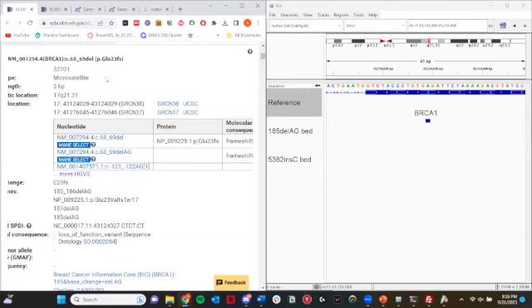But when I subtracted it, it was more like around 60. So I think it might be splice variants. Yeah, the short answer is isoform. But which one is the canonical one, the reference one? Depending on that, the number can be different.